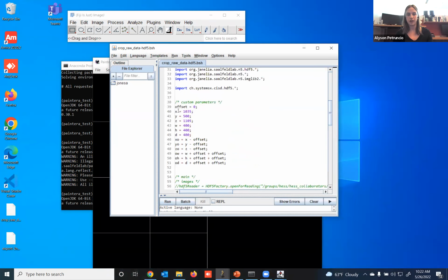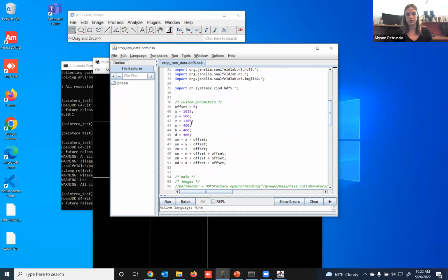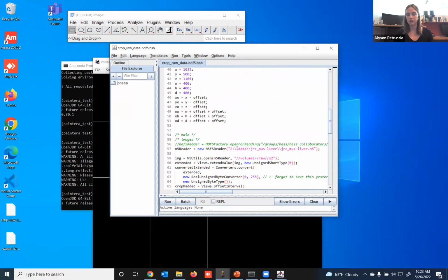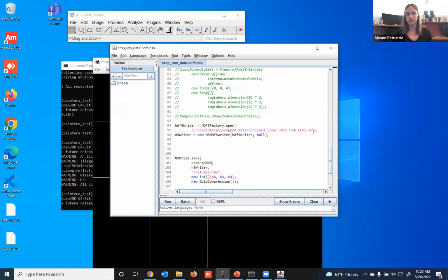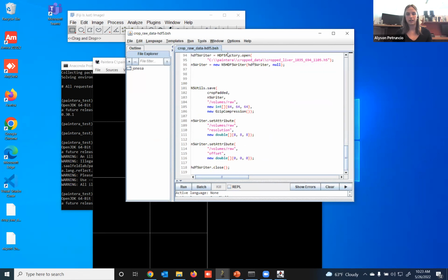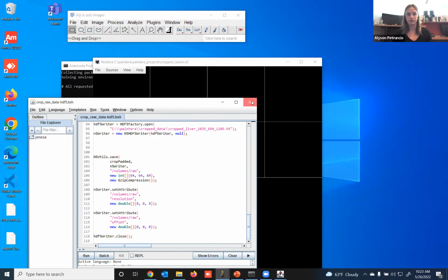So we can specify the coordinates that we prefer, what resolution based on the multi-res data, the offset if necessary, if we're looking for a buffer, which we will use in the Amira-based labels later. And then we'll output this H5 file to a directory, and we'll ensure that there is metadata included so that it can be recognized by Paintera.